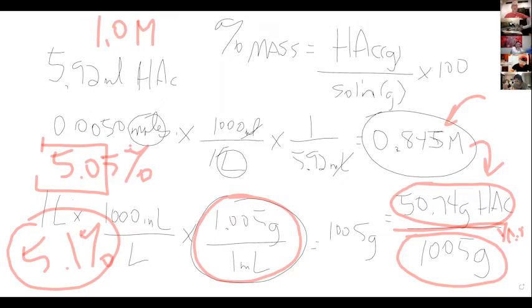You could dilute the sample, but the only point that would do is give you a more dilute color. It wouldn't give you any more accurate determinations. In fact, it might be worse because then you wouldn't notice the really subtle one drop change if you had a more dilute sample.